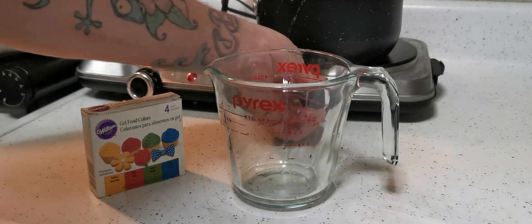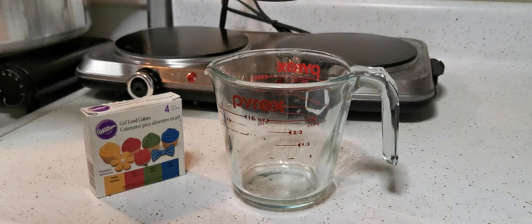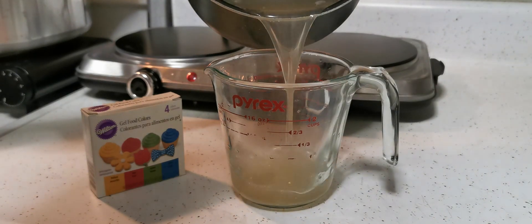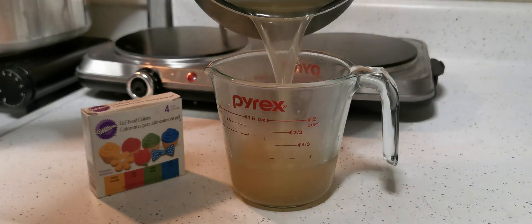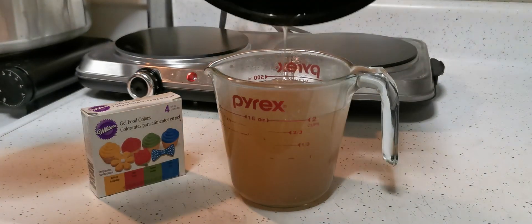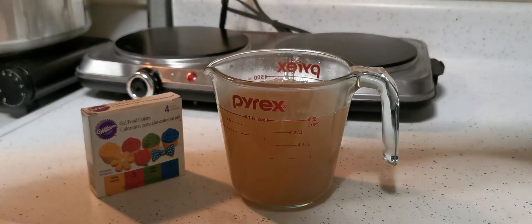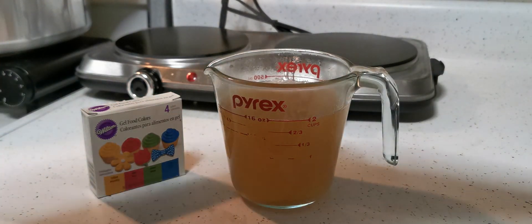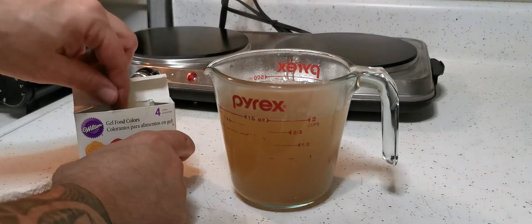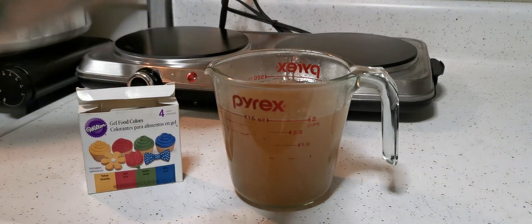Once everything is fully dissolved, we're turning the heat off and we're going to transfer our mixture back to the mixing cup. We're going to add just a couple drops of food coloring. The gel colors are pretty strong — you don't need a whole lot.